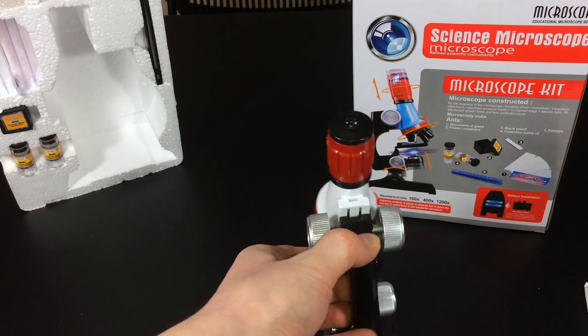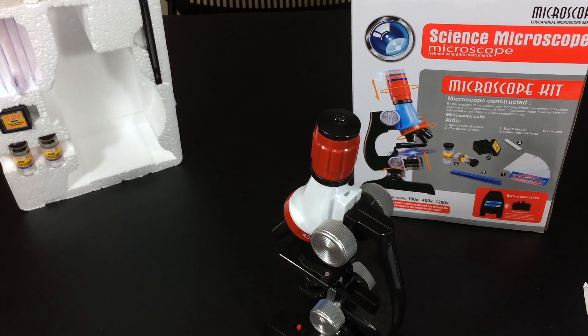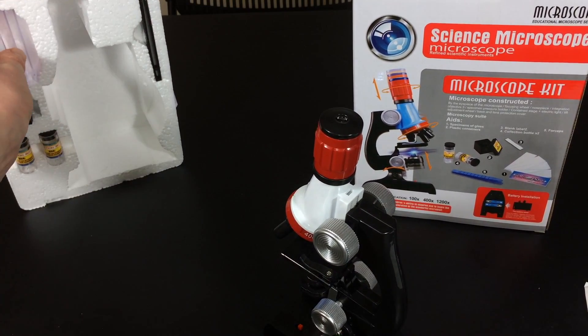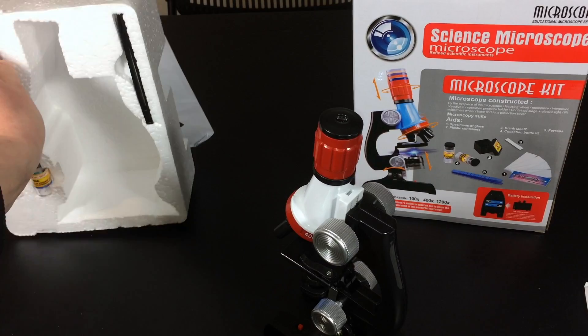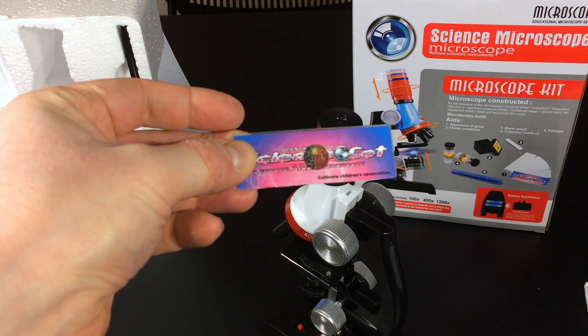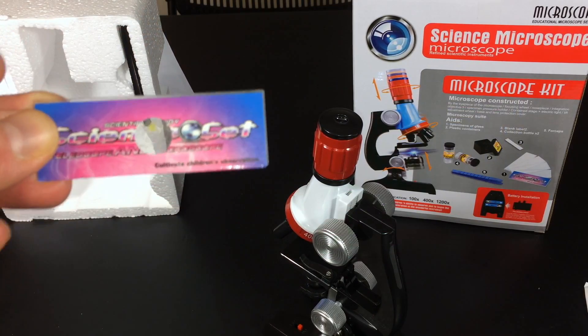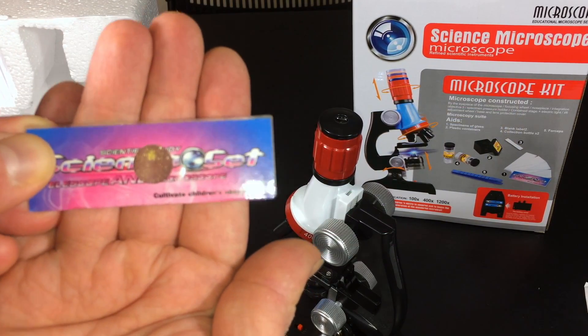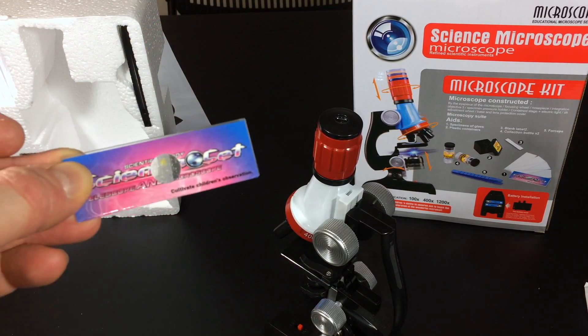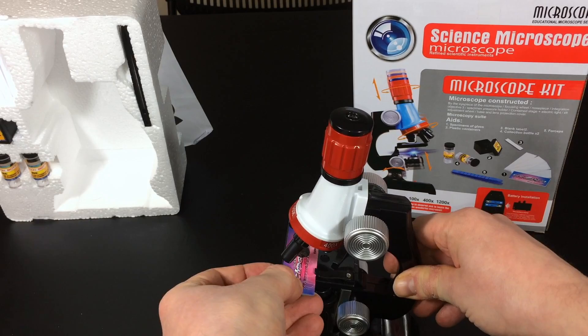Okay, so let me just slide in a slide in here and then I'm going to be able to see if we could see anything through this thing. So let's just begin with the included one right here. You can tell it has these kind of little elements, these little fiber elements in there. Now I'm not quite sure what they are, but interested to see. So I'm just going to slide it in right here.